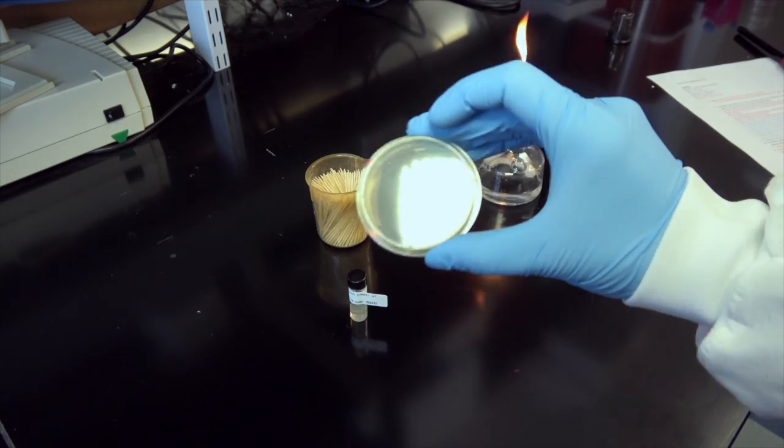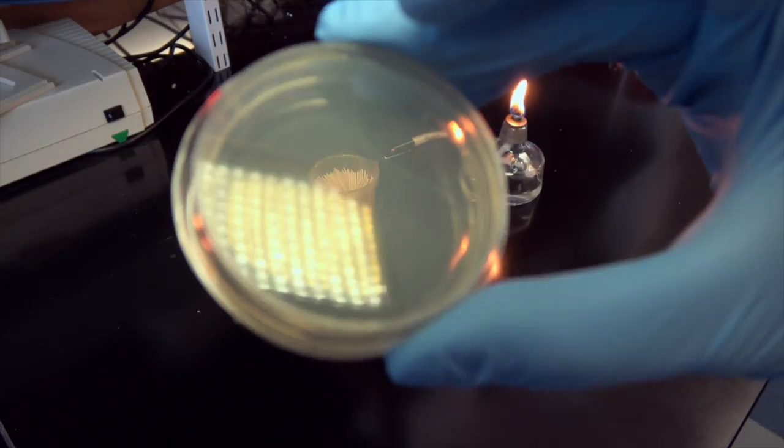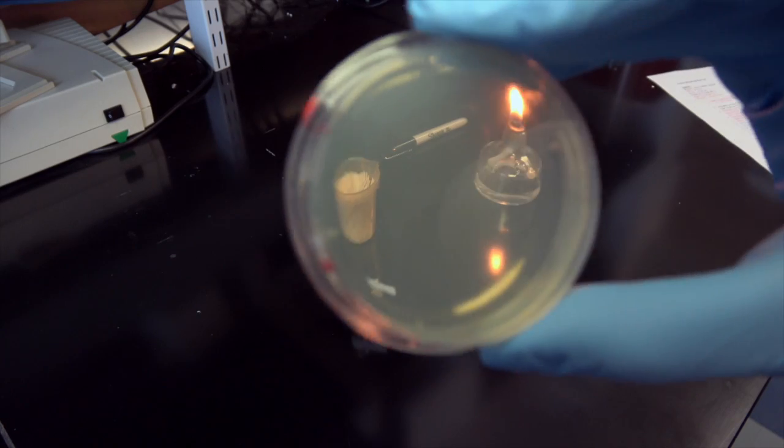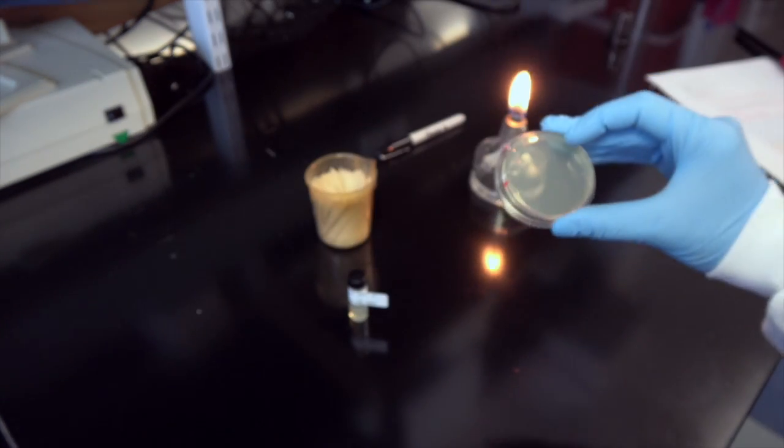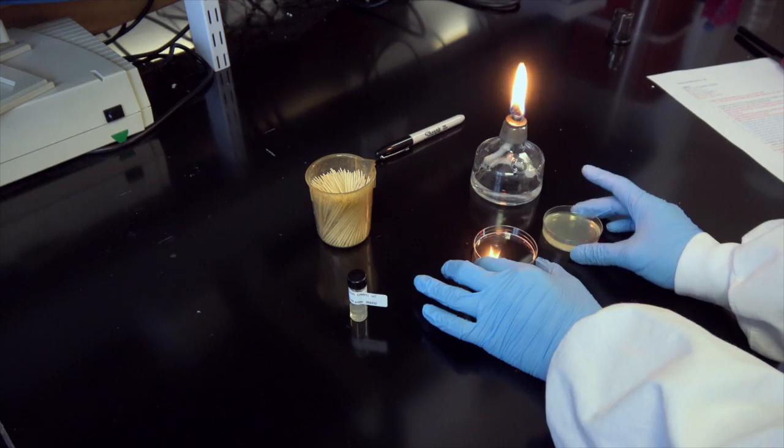First, we take out our LB agar plate with the appropriate antibiotic, making sure that there is no contamination on the plate and that it is dry. If the plate has condensation, you can place it next to a flame with the lid open for about 10 minutes to dry it out.